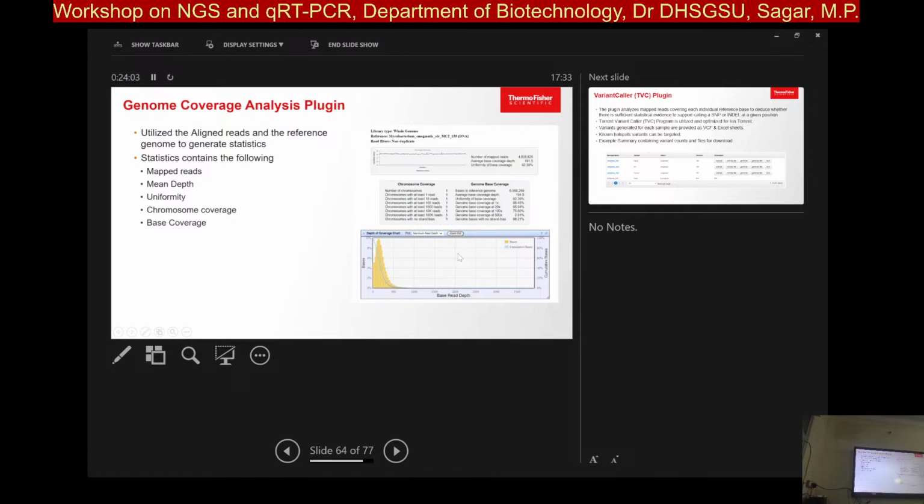So how does that happen? It takes 20% of this data. If I'm saying 191, I'll take it as 200x. So I'm taking 20% of that data. 20% of 200, how much? Okay, 40, right? So easy. I know you're drained out, but it's okay. This is what you remember at night, particularly. So with 40, it takes the minimum value of 40 and screens all those positions in your genome where you're mapping. And it tells you 92% of the region is above 40x.